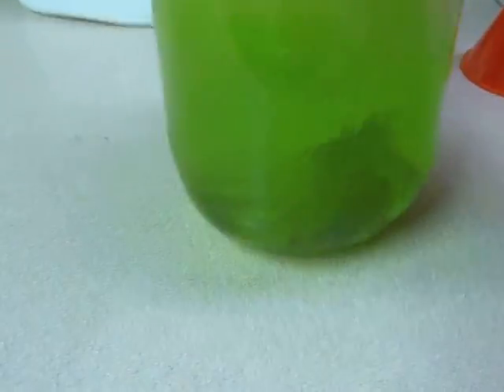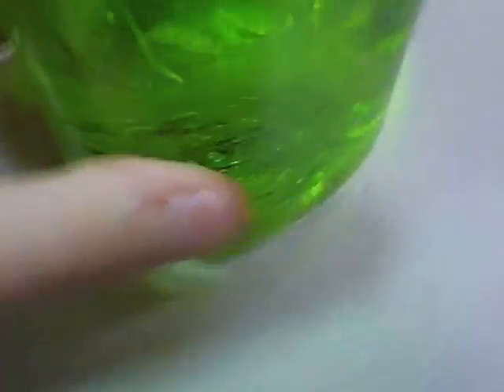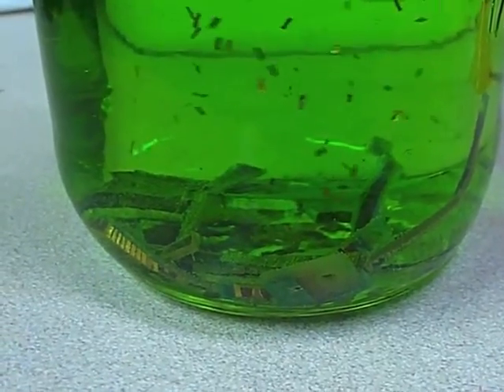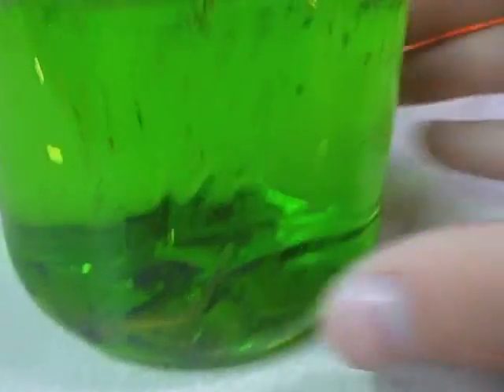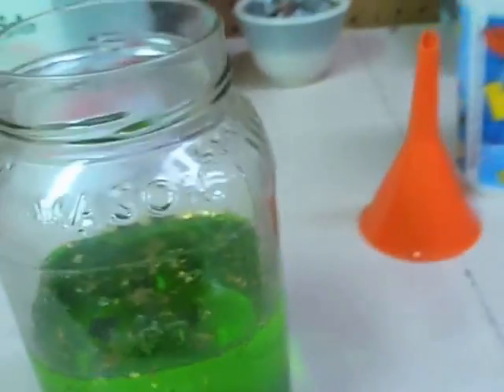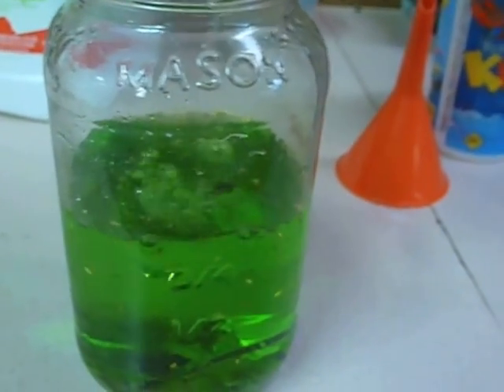Just agitate it every once in a while and mix it up. A good way to tell that it's working is you'll see these bubbles forming on the surfaces — that's a good sign so that you know it's working. Already you can see on the surface little flakes of gold floating to the top. You can see that more of the gold films have floated to the top and separated from the circuit boards, but not many bubbles are left. So I'm going to add some more hydrogen peroxide to kick-start the reaction again.